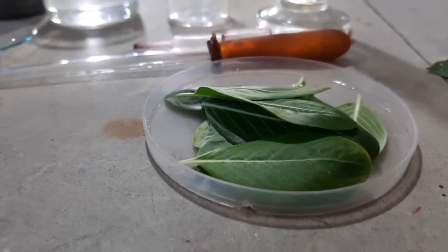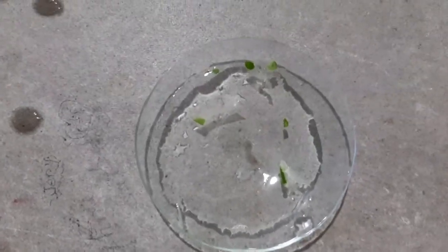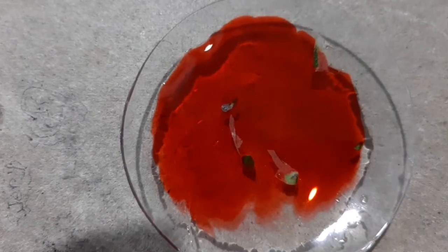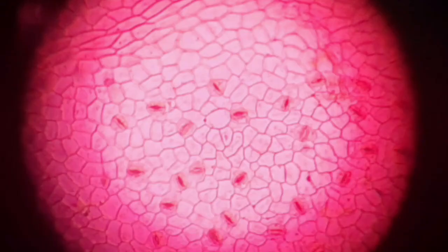So my dear students, you have seen that the stomata that we viewed under the microscope are the stomata from a dicot leaf. Periwinkle is a dicot plant, so the stomata are having the kidney shape. The guard cells are kidney shaped.